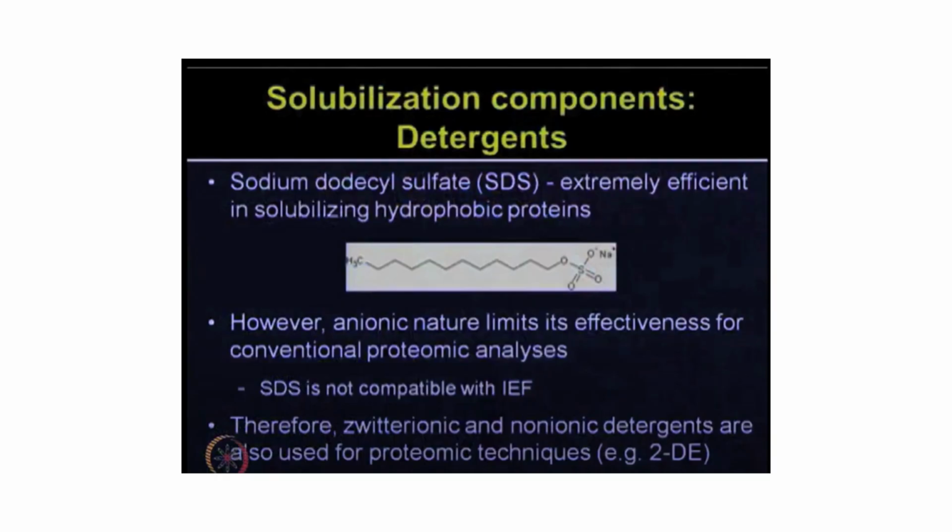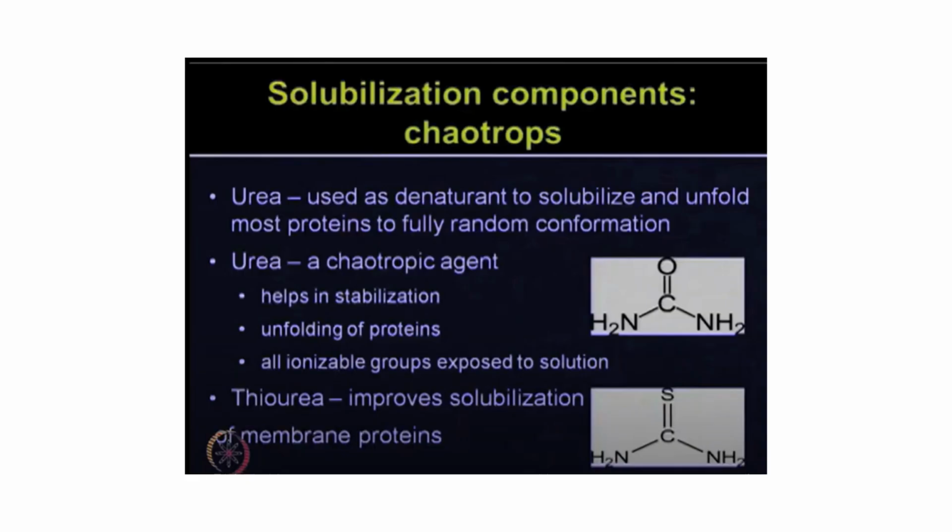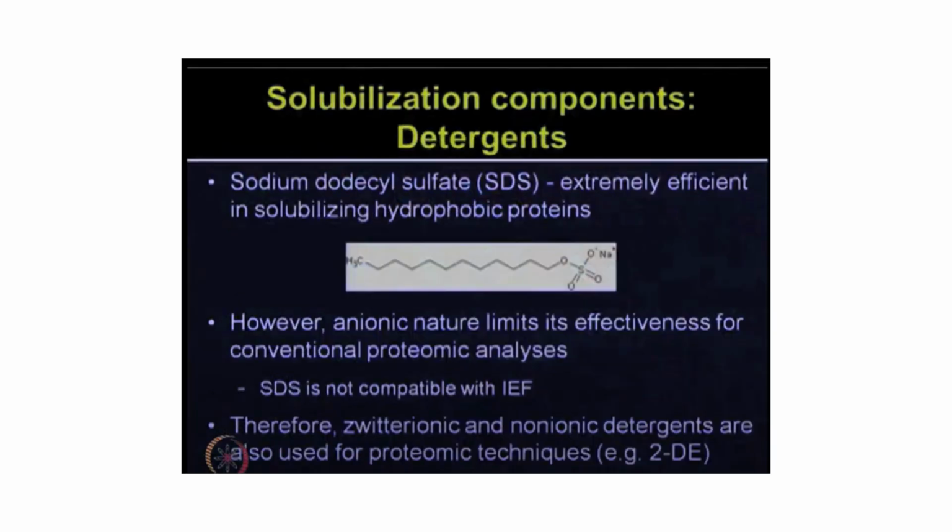For the IEF technique, you can directly add your lysate itself, and it has a mixture of proteins. When we are dealing with IEF, maybe I can explain exactly what type of samples can be added and how it can be used.